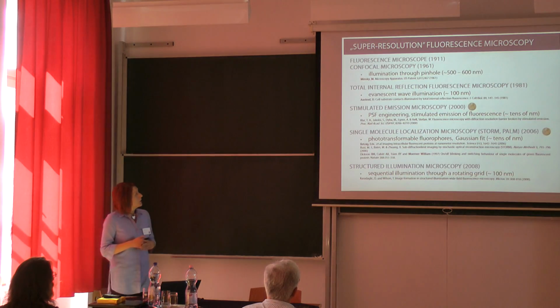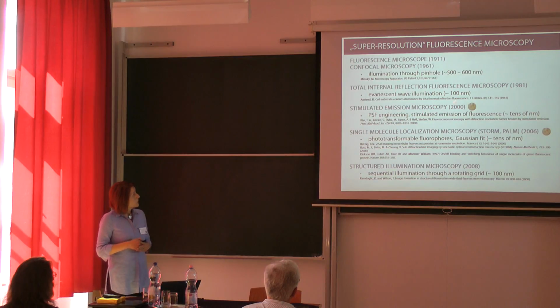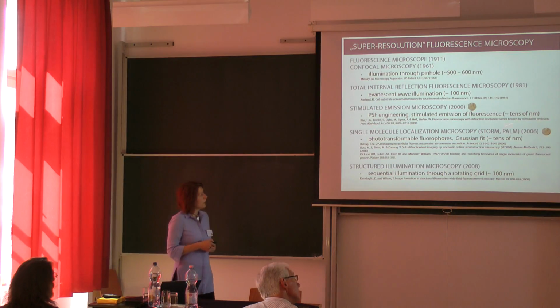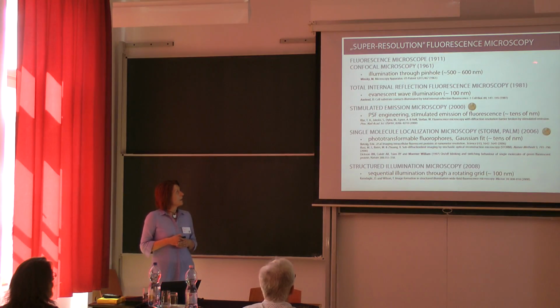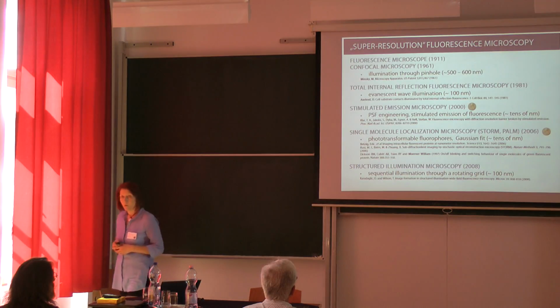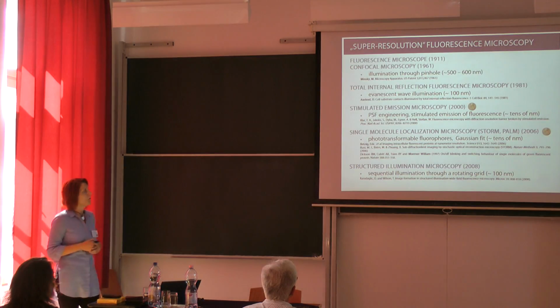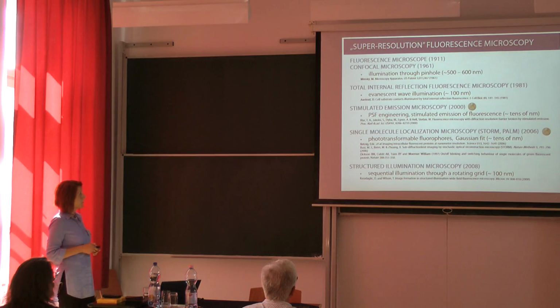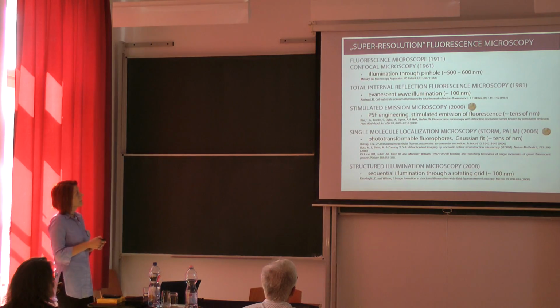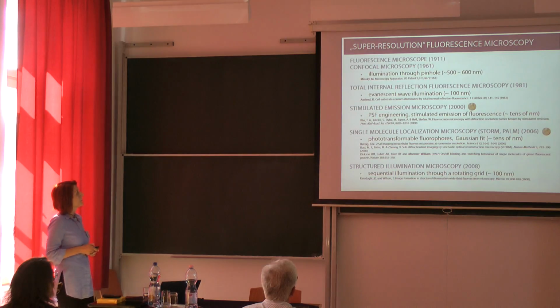Okay. So these two techniques, the stimulated emission depletion microscopy and the single molecule localization microscopy, the STORM, stochastic optical reconstruction microscopy, and the PALM, photoactivated localization microscopy techniques, are highlighted because these techniques were awarded the Nobel Prize 2 years ago. Okay, so now let's go back to total internal reflection fluorescence microscopy.